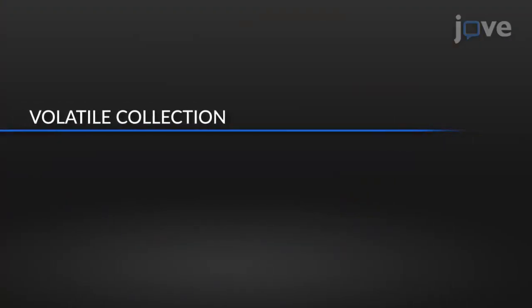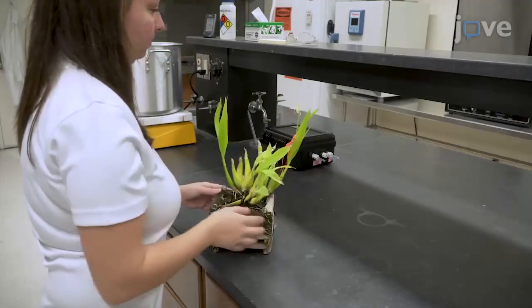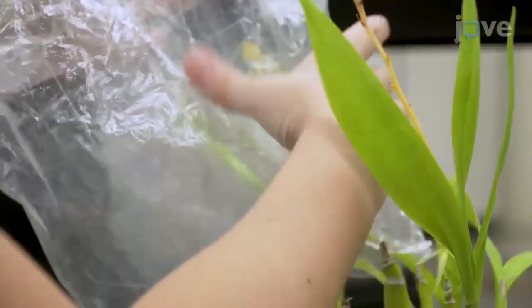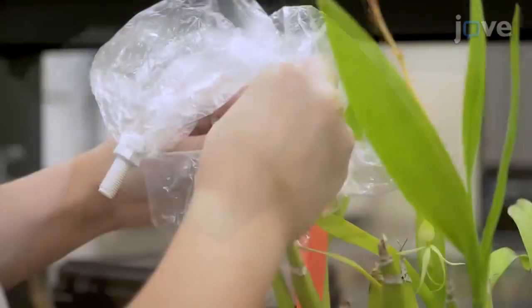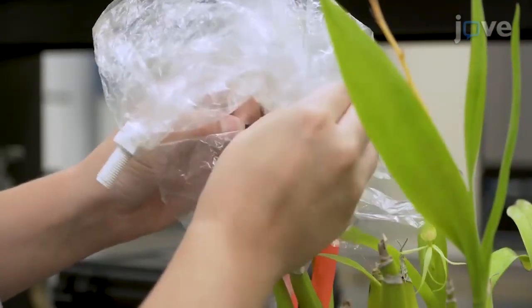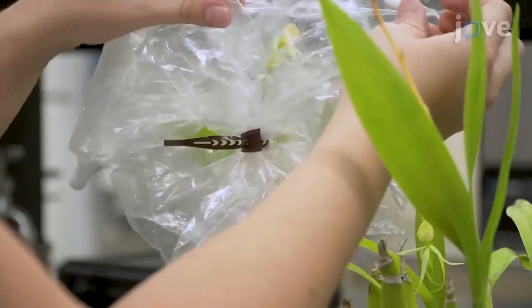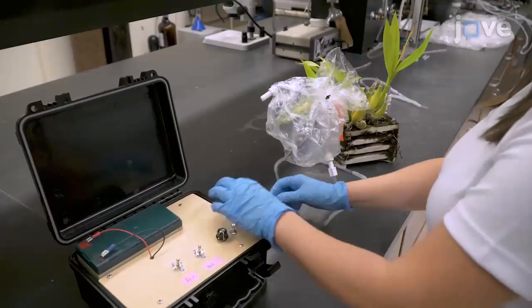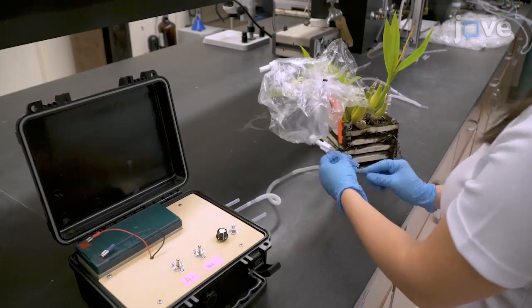Depending on the duration of the blooming time, if possible wait at least 24 hours after blooming to collect the sample. Cover the selected flower with a baked oven bag and cinch the bag together tightly with a plastic zip tie below the flower to prevent unwanted airflow into the bag. Wearing sterile neoprene gloves, attach a tube from the air outlet of the collection equipment and connect it to one of the bulkhead unions on the oven bag.